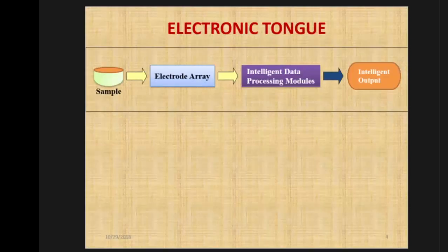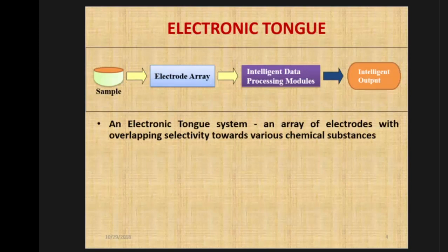Electronic tongue is basically an array of electrochemical sensors. The human tongue is also an array of receptors. Whenever some food chemicals interact with the olfactory and gustative receptors, the stimulus produces some chemical reactions. Those reactions travel to the brain and are interpreted as a fingerprint.